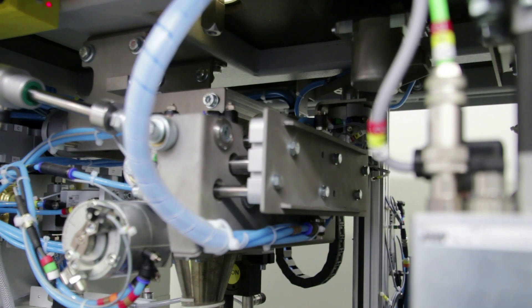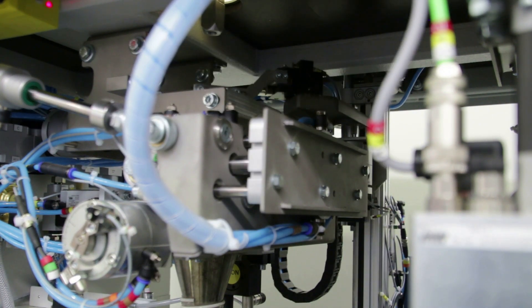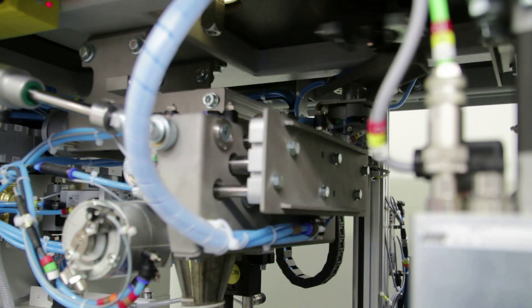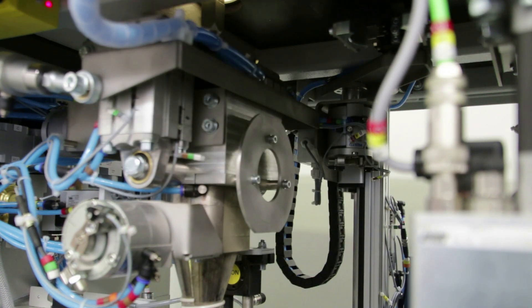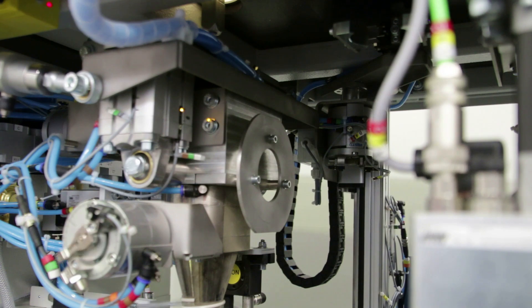The HPMP ensures a virtually dust-free machine room thanks to the completely enclosed material transfer positions and extensive air extraction.